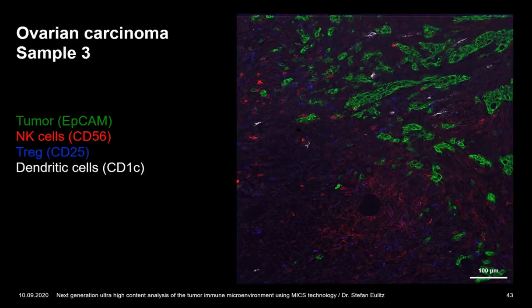But when we look at the markers we have shown, these were only 12 markers. But as you could see in the beginning, we have stained many, many more markers. So in order to be able to analyze this, I will show you the next necessary steps here.